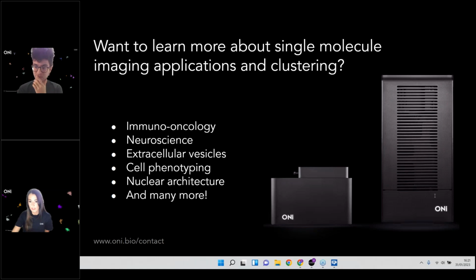Thank you for that, Haraman. Our next question is, don't you run the risk of counting the same localizations twice with constrained clustering? So actually, no. The way that constrained clustering works is that it has the same principle as HDBSCAN, which is that you cannot have a cluster and its parent. So any clusters that are selected by the constrained clustering will be using points exclusively. No point can appear in two clusters by definition in HDBSCAN, and we keep that same logic to protect us from that same worry in constrained clustering as well. There is some checking in the algorithm to say, if this cluster is in, then none of these other clusters which are associated can be in.